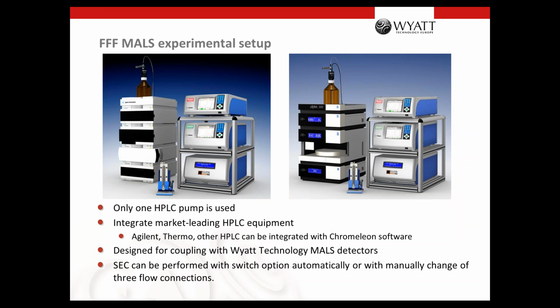It is also possible to use the HPLC manually in SEC mode. That means that you have to change the flow connection and bypass the Eclipse. And then you can use the whole setup with the UV, the MALS detector, and the RI detector from Wyatt just for normal standard SEC measurements. That's very often done by customers because you get more information if you use different separation principles.